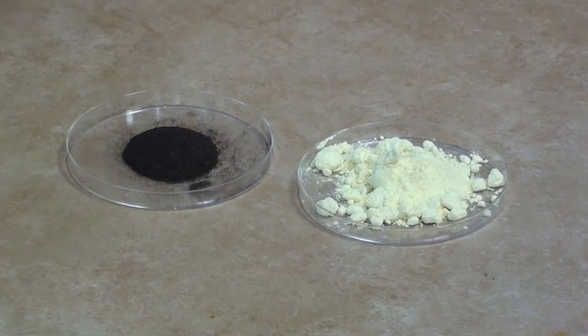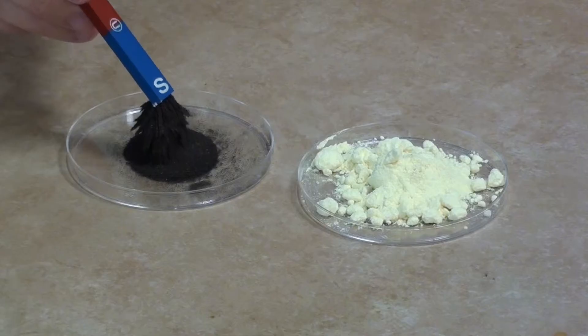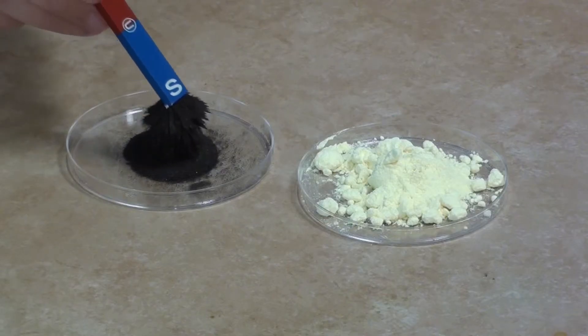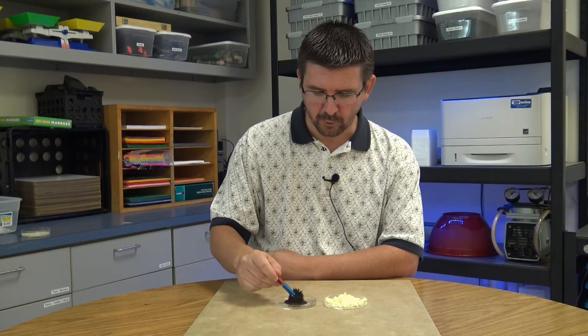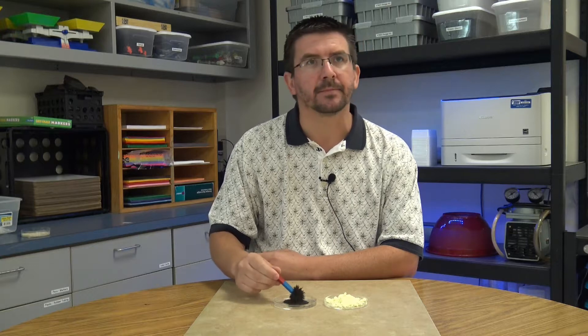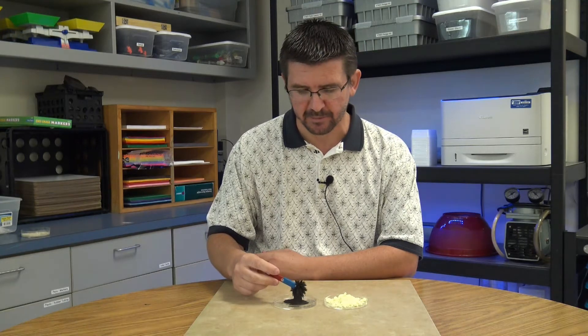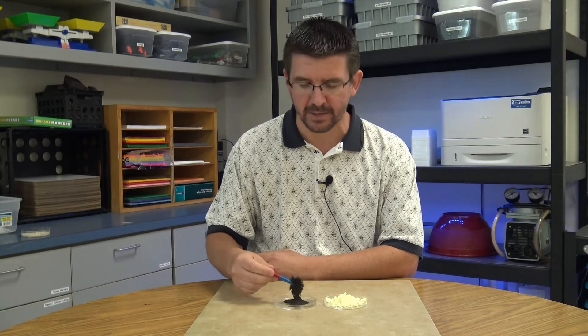But as soon as I put the magnet near the iron, the magnet attracts the iron and it does, as we say, stick to the magnet. So you can see that we're able to use the magnet to pick up the iron filings because of that ferromagnetic property of the iron.